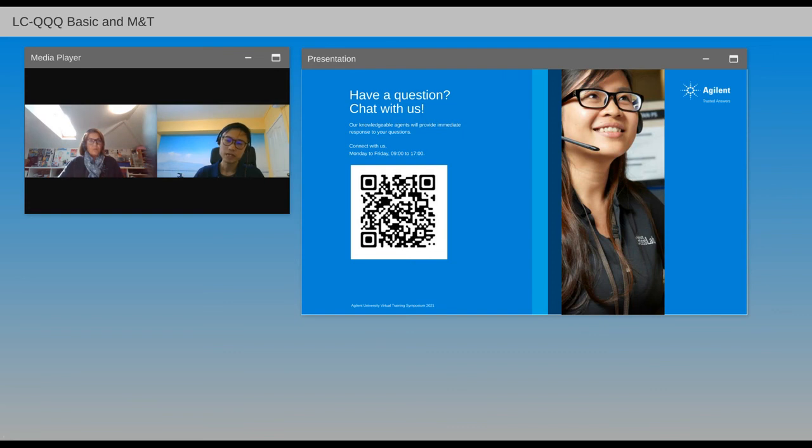This article was basically looking at peptides of interest, so things like bradykinin, or even methionine enkephalin and oxytocin. What I really learned from this article is that a clear message is to really prepare our mobile phase fresh whenever we need, especially when we need some kind of buffer concentration and also pH.